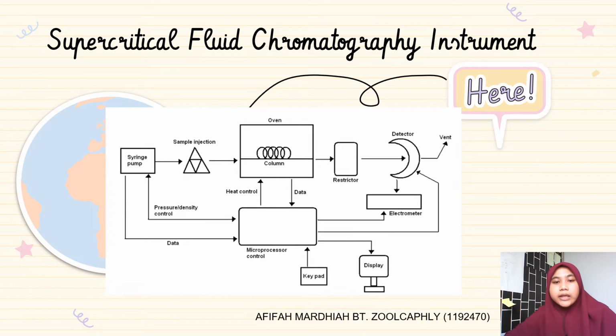A microprocessor is placed in the SFC instrument. This unit collects data for pressure, oven temperature, and detector performance to control the related pieces of the instrument.